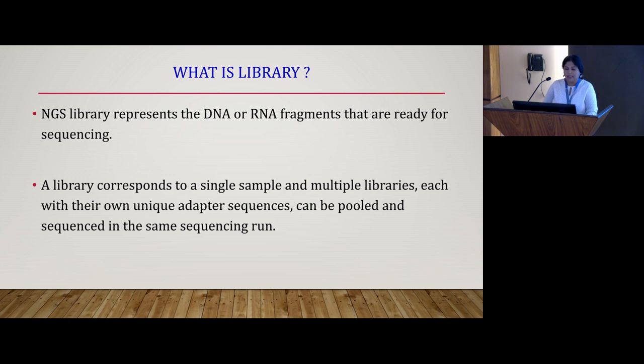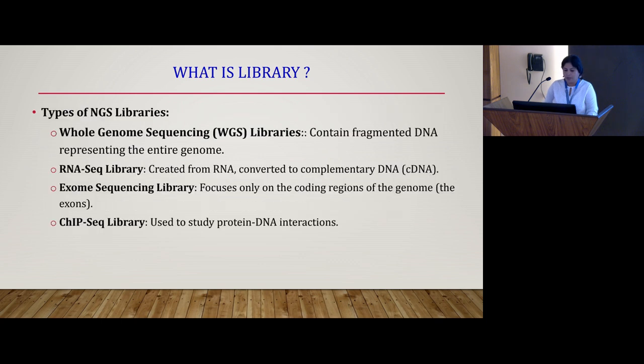Library represents the DNA or the RNA fragments that are ready for sequencing. So basically, library corresponds to a single sample, and multiple libraries, each with their own unique adapter sequences, can be pooled and sequenced in the same sequencing run. These are different types of libraries which have already been discussed by Nikhil sir, like whole genome sequencing library, RNA-seq library, exome sequencing library. All depends upon your sample material and the panel which you are interested in.